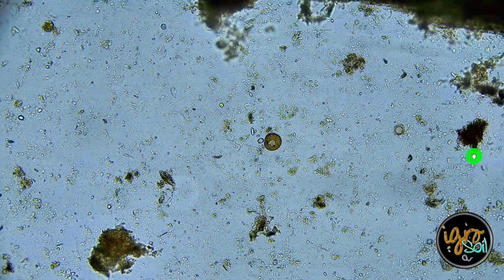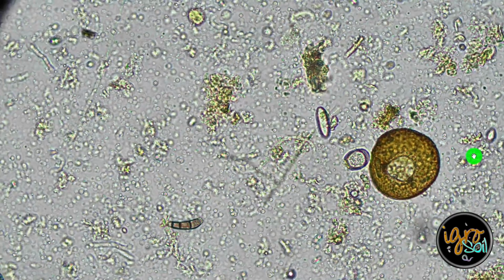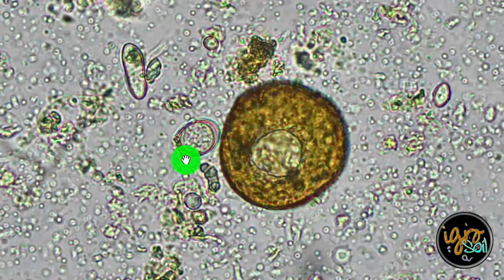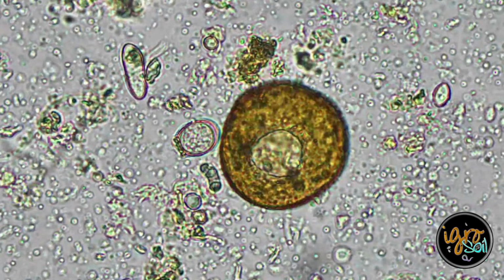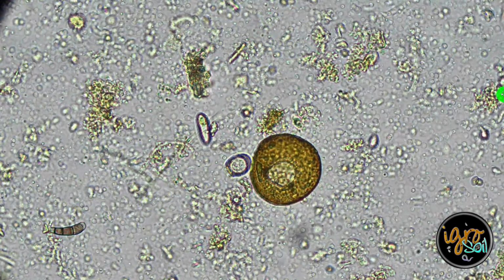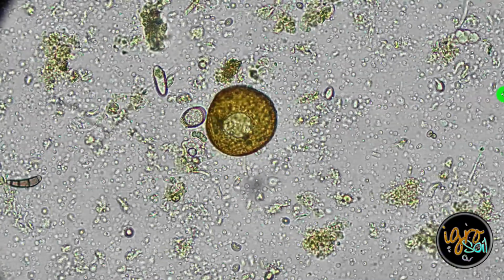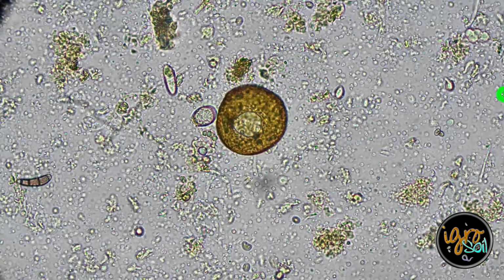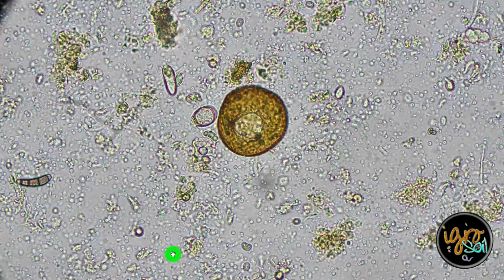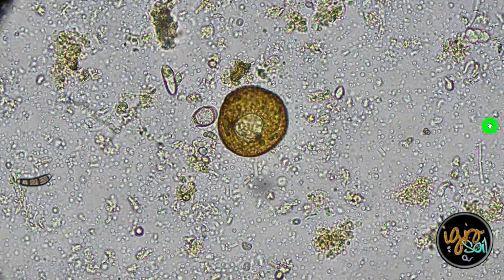We need that diversity. Some of the better looking Arcella I've ever seen. Clean, precise. Look at that. Just right next to a testate amoeba. And whatever that thing is, there's your testate right here. And there's your Arcella right here. And that shell, by the way, because that is a shell, is made of everything in its surroundings. They build their own shells, like types of crustacean in a way. And then you've got that just kind of wigging out underneath it all. And then over here, there's just so much life. There's another spore. That's alive. Whatever it is, it's all alive.